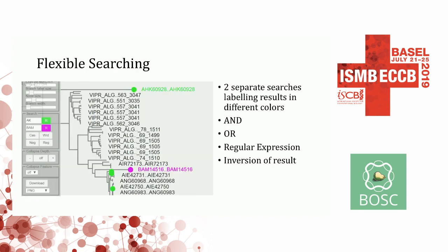I think this feature is relatively a highlight, and for my personal use it's very useful — it's the searching. You have two search fields and can search two things in parallel, which will be colored in different colors, as you can see in this example — green and red. This search also allows you to do AND searches or regular expression searches. You can invert the result, so it's quite flexible.